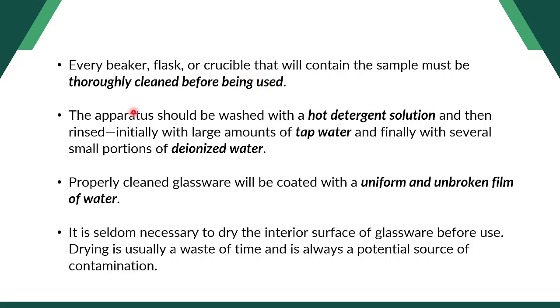Now, in washing your apparatus, you should use a hot detergent solution. So, dili lang pwedeng diretso dayon tubig, kamot, pahid. Dapat mogamit ta og solution, mga liquid nga dishwashing soap. Then after ana, of course, i-rinse nato siya with large amounts of tap water. Kanang tubig nga gikan sa faucet nato.